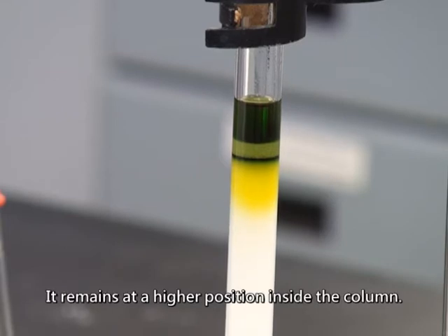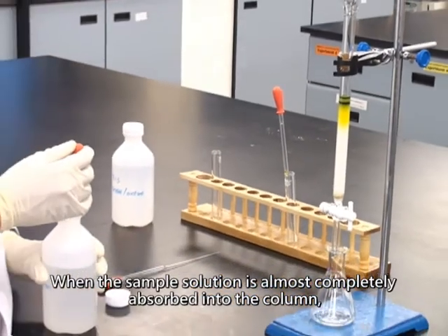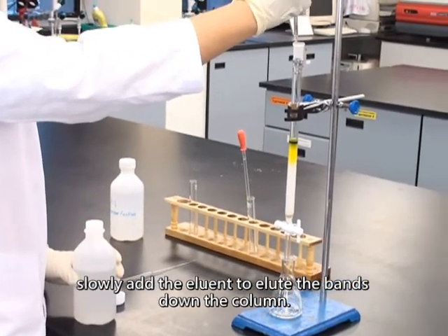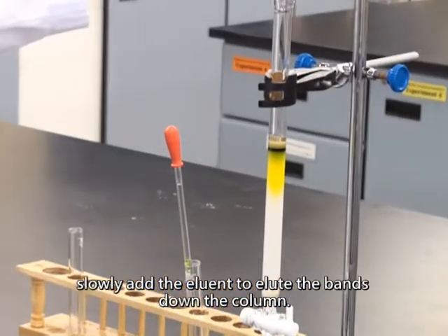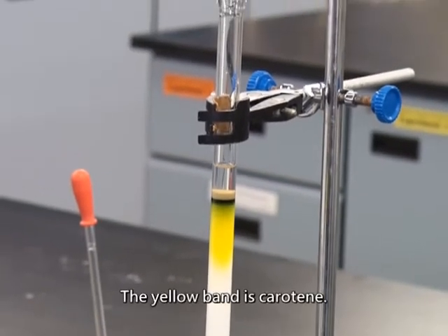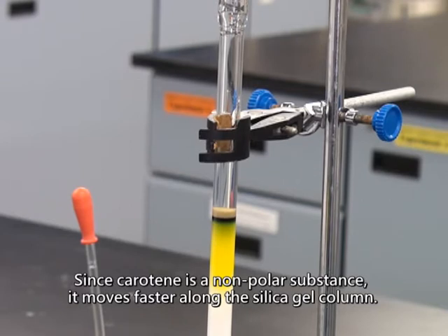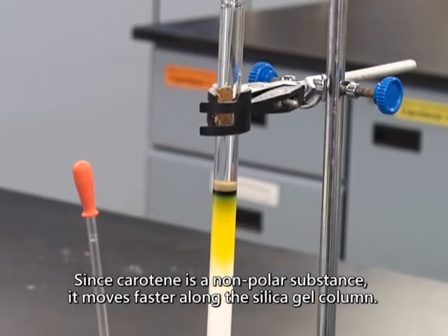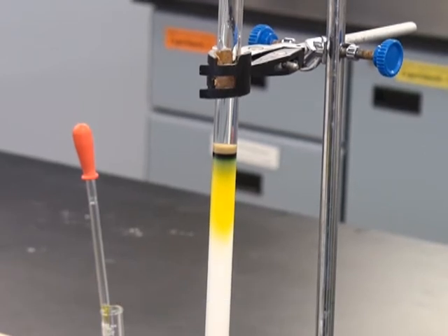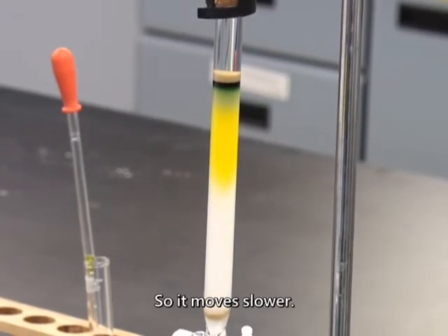There is a green band moving slower, which remains at a higher position inside the column. When the sample solution is almost completely absorbed into the column, slowly add the eluent to elute the bands down the column. The yellow band is carotene. Since carotene is a non-polar substance, it moves faster along the silica gel column. The green band is chlorophyll. Since chlorophyll is more polar, it is attracted more strongly by the silica gel, so it moves slower.